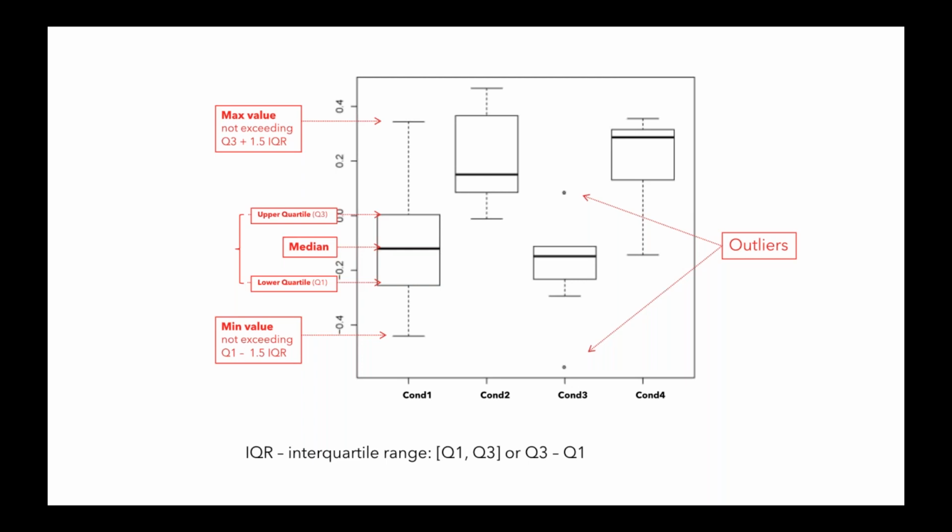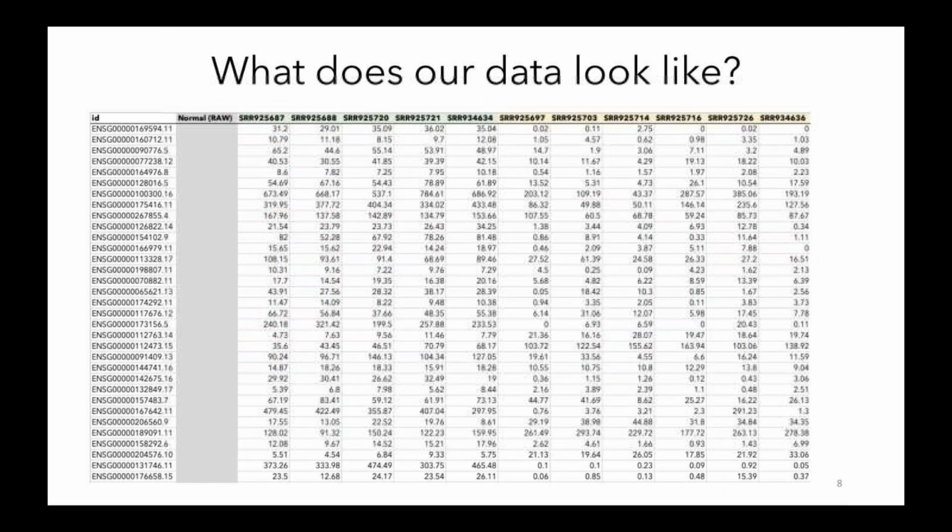Which is an important feature of data when you have strange values that don't fit in with how the data looks overall. So when we have this kind of visualization, we can visually compare the difference between our samples. And of course, within each sample, we have quite a number of actual genes and gene expression. So last time, as you remember, we started looking at our data from this perspective, right?